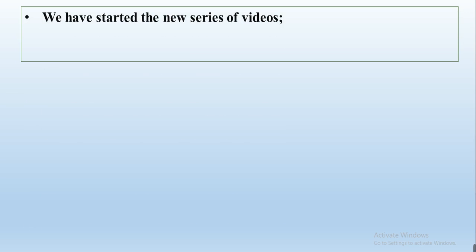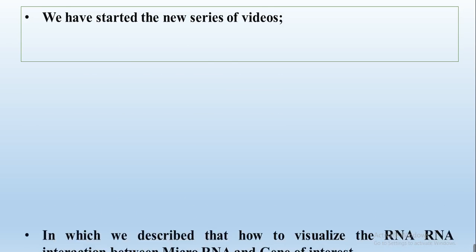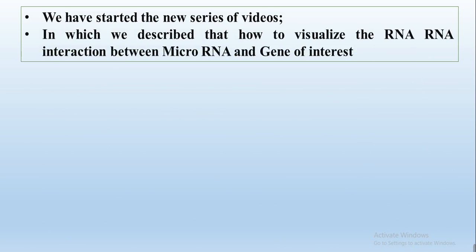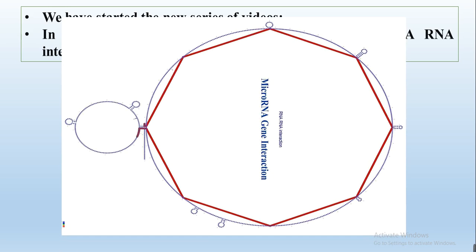We have started a new series of videos in which we will describe the RNA-RNA interaction, or how to visualize the RNA-RNA interaction between the micro-RNA and our gene of interest. This is the 2D visualization of our gene of interest and micro-RNA. It shows the rigs and small base pairs, the loops, and shows that this is my gene of interest. These lines show the micro-RNA that interact with my gene and regulate it, showing on which base of my gene the micro-RNA interacts and regulates it.